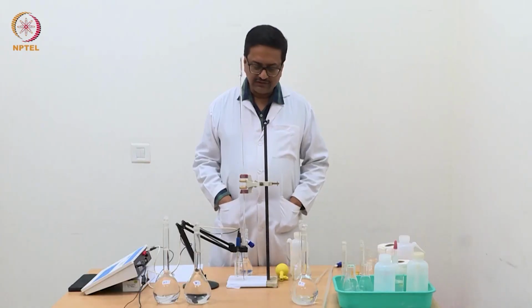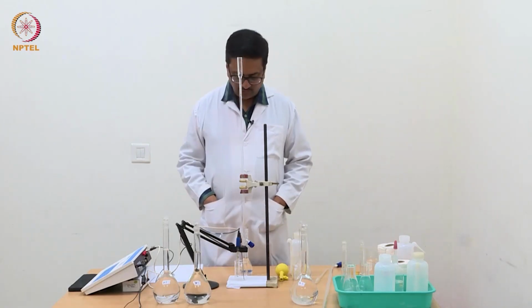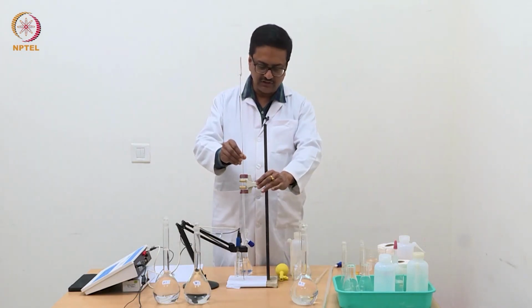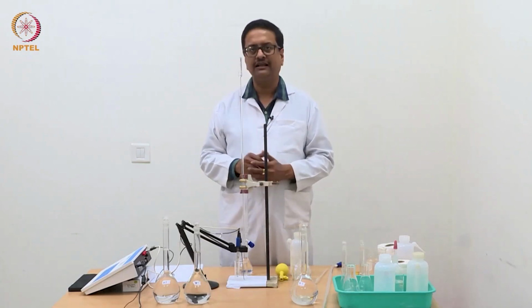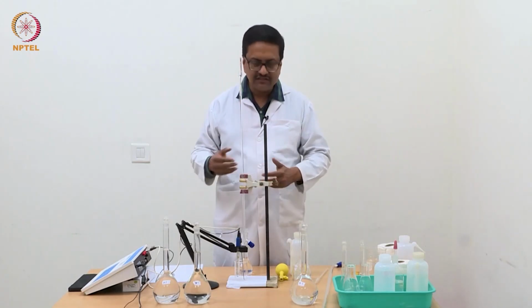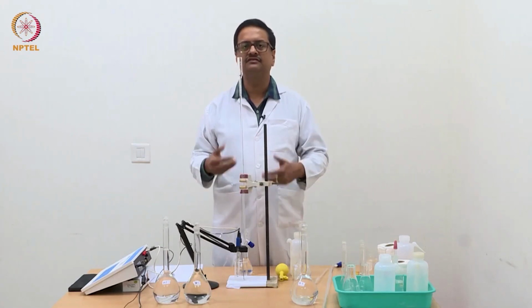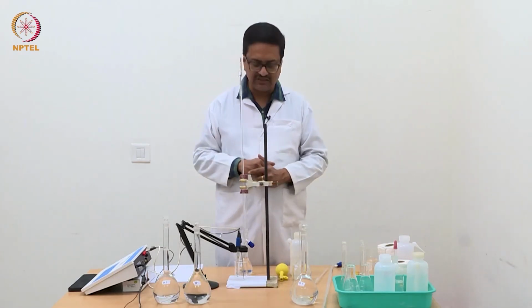And I would like to again emphasize this, that when you are doing a potentiometric titration, one has to use a 10 times stronger solution in the burette for the estimation, so that the change in volume between the starting point and end point is very little, because pH is a quantity which not only depends on the number of H plus ions, it depends on the number of H plus ions per unit volume, that is the concentration of H plus ions.